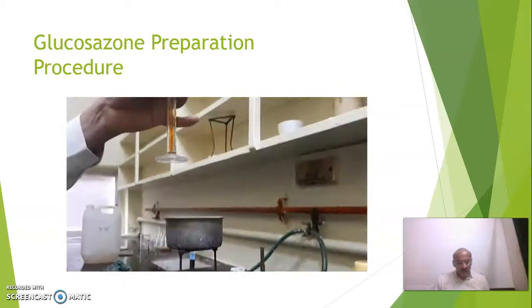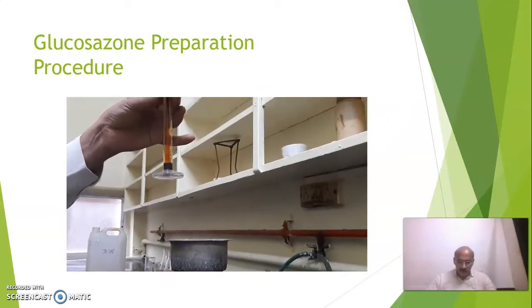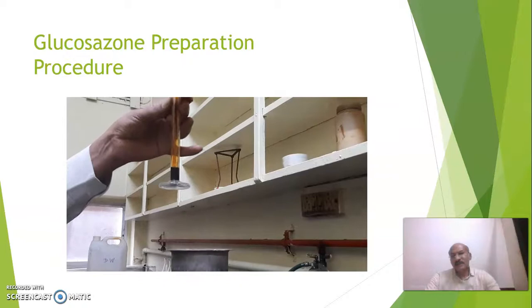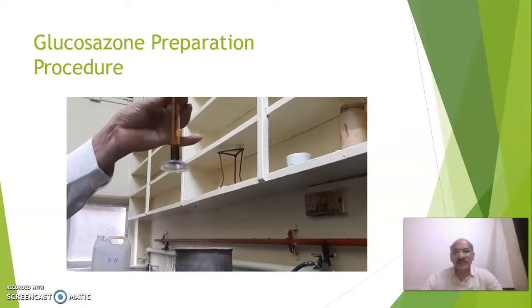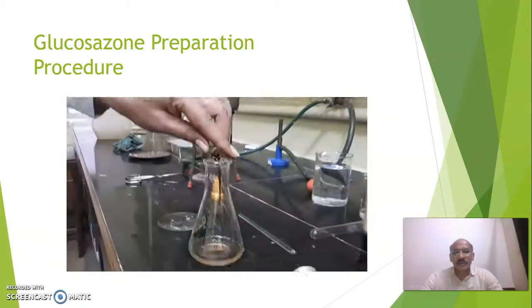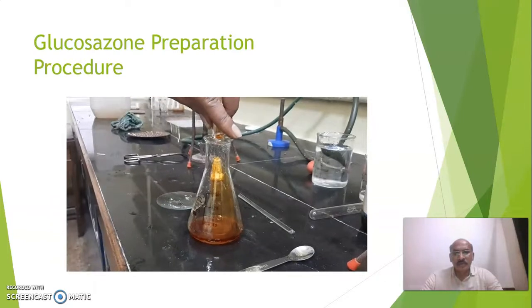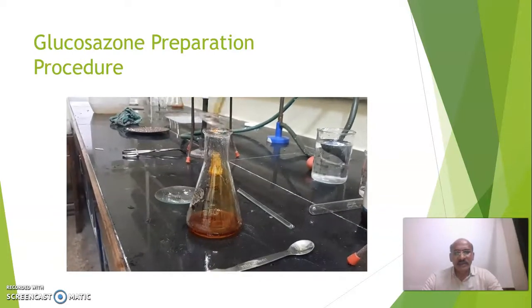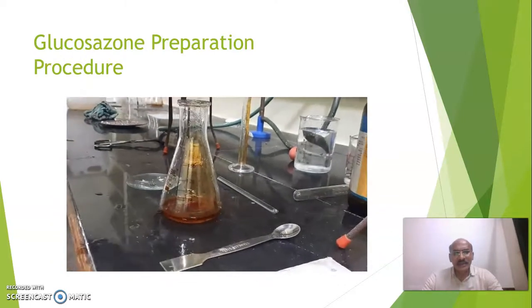After dissolution, we have to add phenylhydrazine and glacial acetic acid. Phenylhydrazine is added, glacial acetic acid is added.